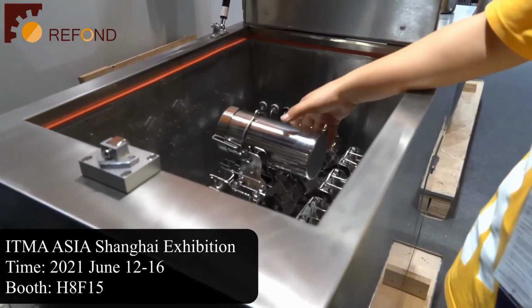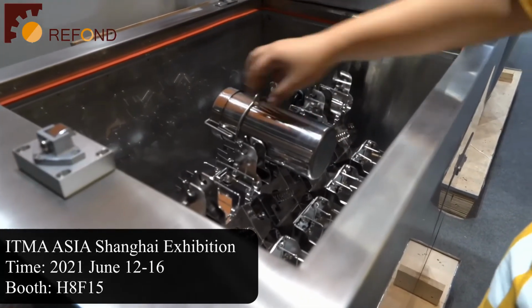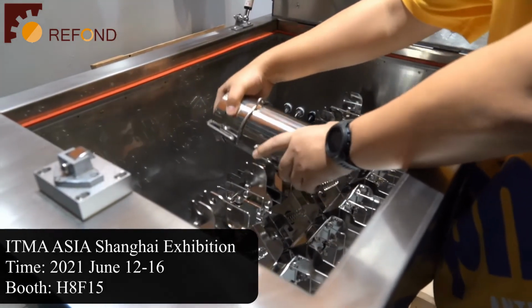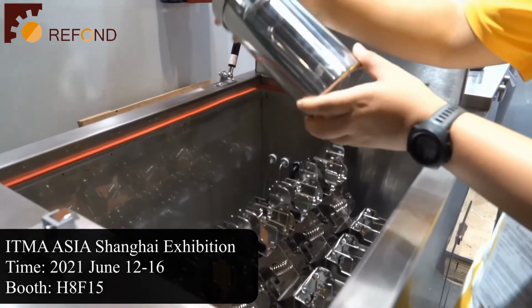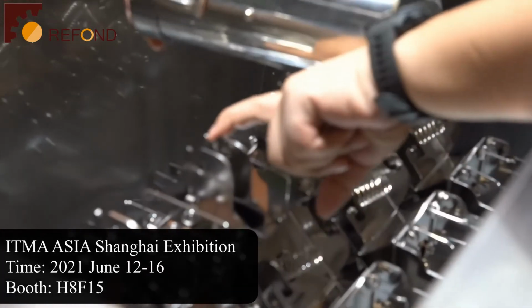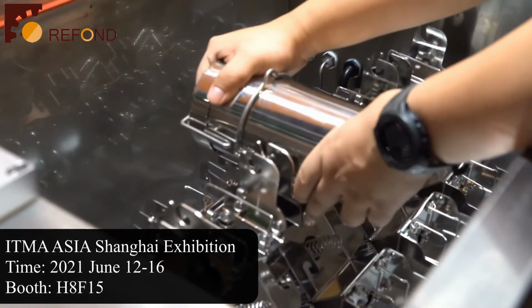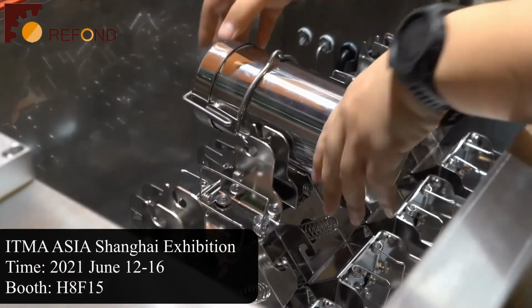Mounting of the cups, the test containers, is very easy. This is how you mount a large container. You just push down and then slide it forward, and you can get the container out. To put it in, you just do it in reverse. Align this pin on the side with the notch at the side of the holder. Push it down and then slide backward. And that's how you put on a test container.